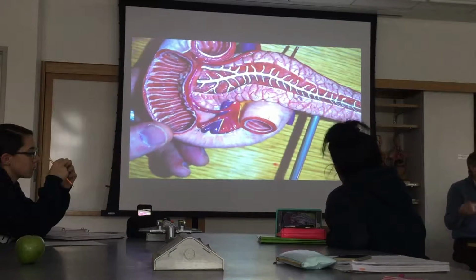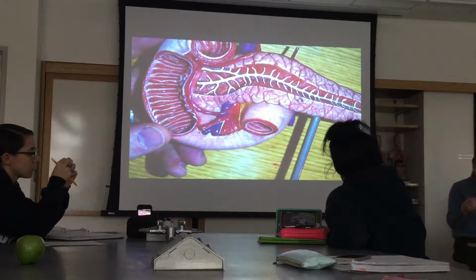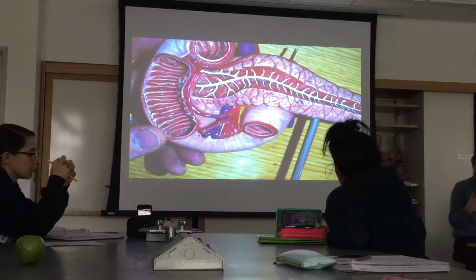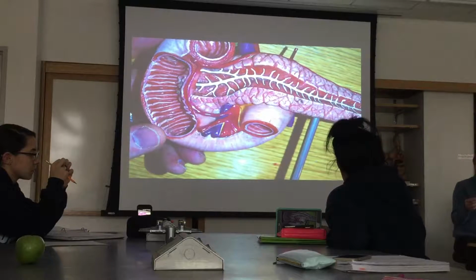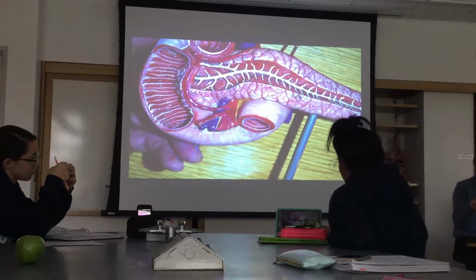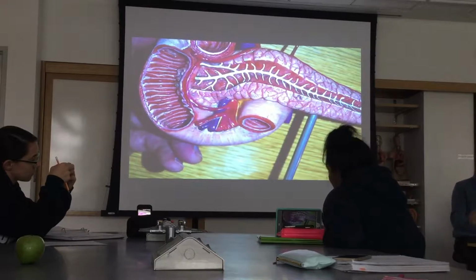On the other hand, if I ask you about ileum, I would do it someplace close to where the large intestine begins, something to give you your bearings. Because if I pull out a random piece of small intestine, you're not really going to be able to tell what it is, probably. You're not going to know if it's jejunum versus ileum.